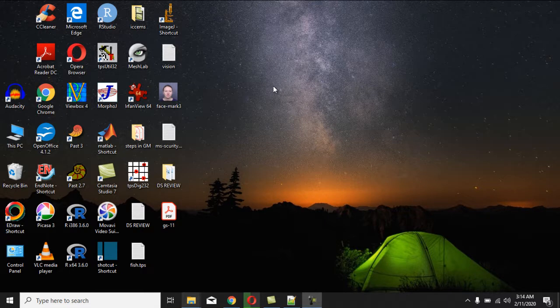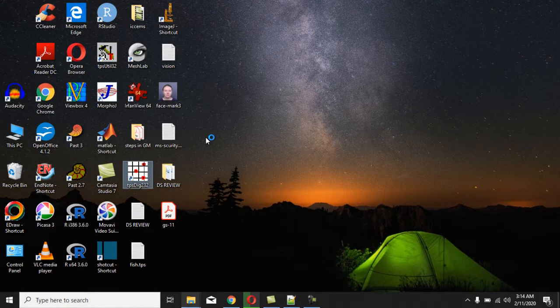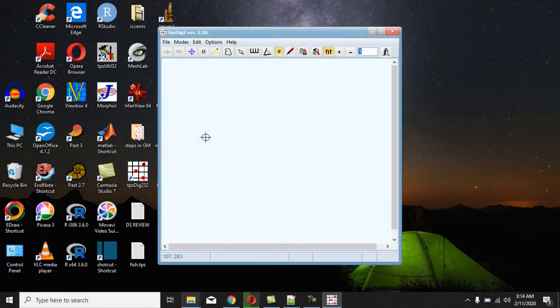Now, before I go further, this is tpsDig. I'm going to open it here. You can download a copy from Google. Just type tpsDig in Google, then download. So this is the interface of tpsDig.